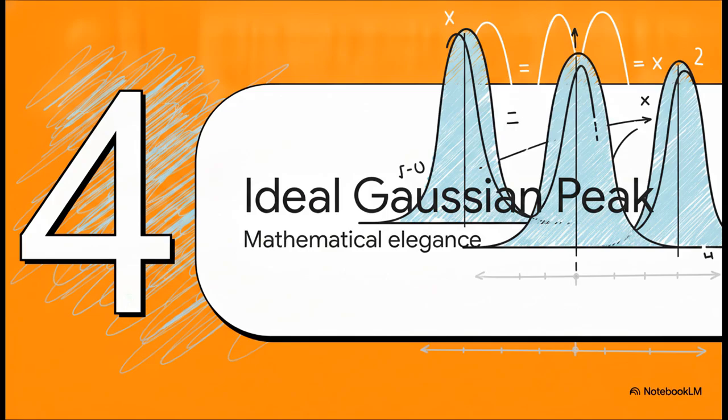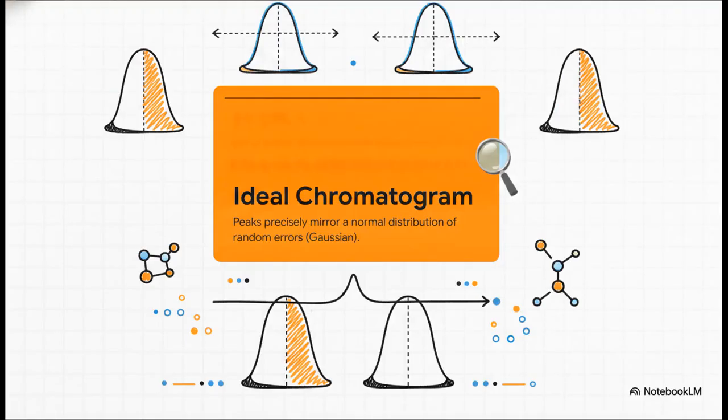Which brings us to Section 4, the ideal Gaussian peak. Let's look at some mathematical elegance. Now that we have our timeline mapped out, let's transition into the mathematical beauty of the peak shapes themselves. Obviously, nature isn't always perfect, right? Real-world chromatograms can have peaks that are a bit asymmetrical or skewed. But the features of an ideal chromatogram are perfectly symmetrical.